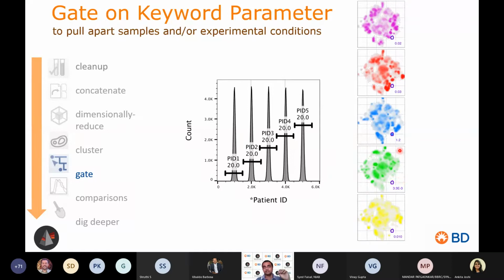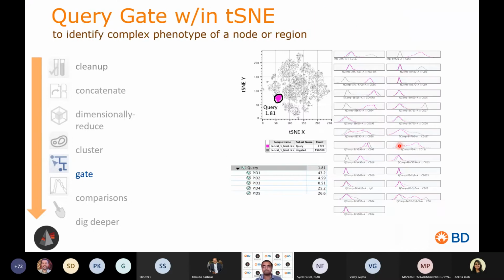And you can see that patient 3 is having a higher proportion of cells here, and maybe this could be linked to some disease phenotype that will be revealed through the other markers in your particular panel. Like the first slide, I showed different tissues, liver, blood, lymph node. Here also you can gate apart through the patients, and you can see whether any particular cell cluster is getting elevated or depleted in any of the patients.